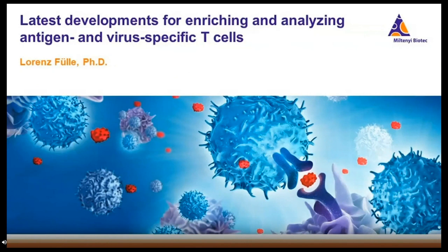Also in regard to the experimental workflow, we at Miltenyi Biotec strongly believe that the future of T-cell analysis has to be more standardized to generate more robust and also comparable results.